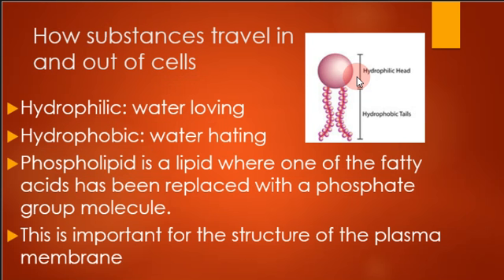I don't think you have a blank on it. It looks like the ends of these things are burning. Ah, there's something changing inside there. Yeah, the cups show your little tube changing.